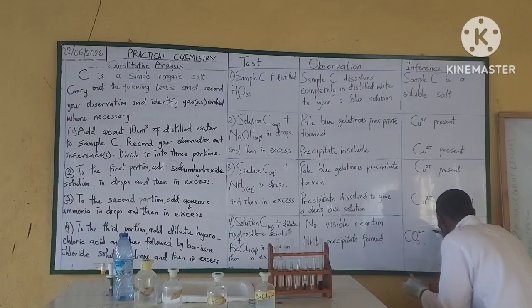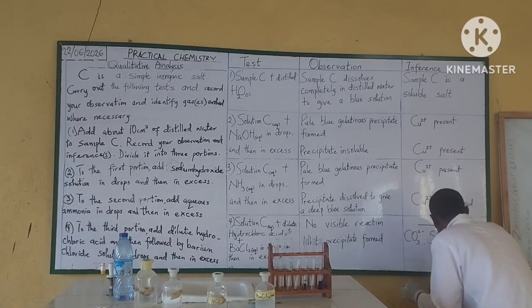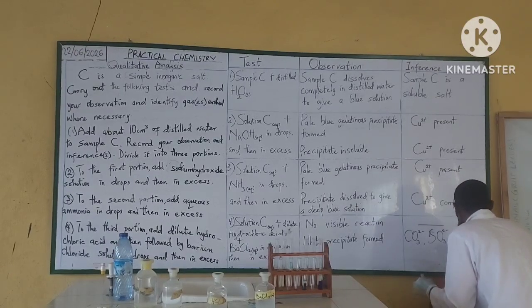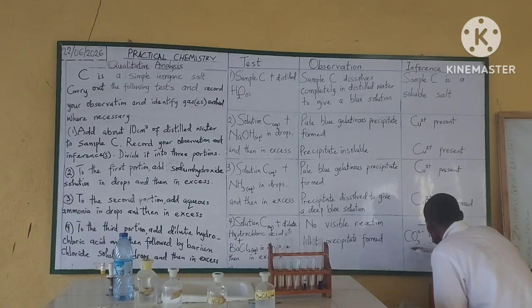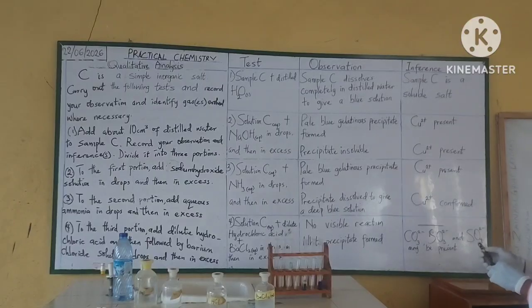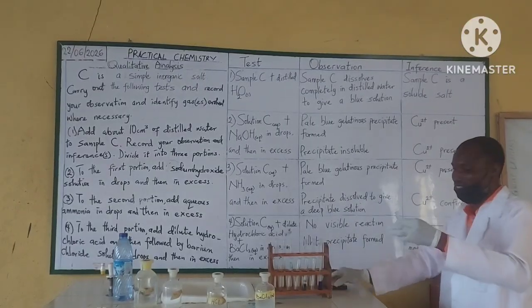We can also have SO3 2- and SO4 2- may be present. We are not sure yet until we carry out the test in excess.